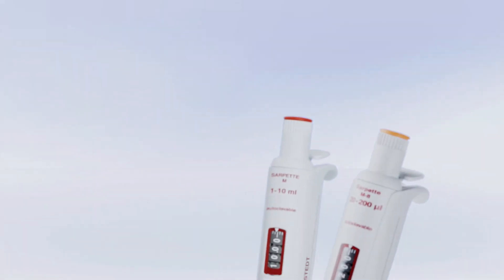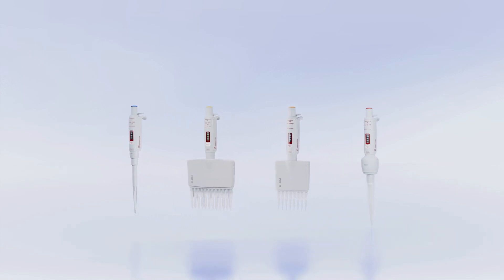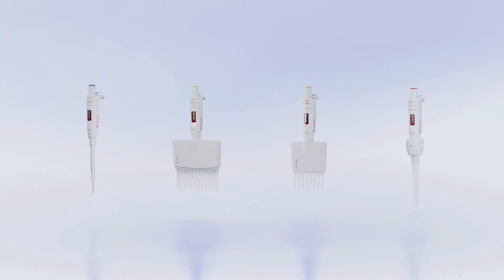Robust and durable, the Sarpette M will accompany your day-to-day lab work for many years to come. The Sarpette M — systematic pipetting.